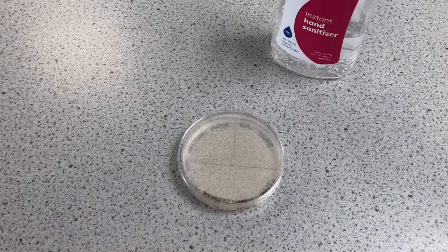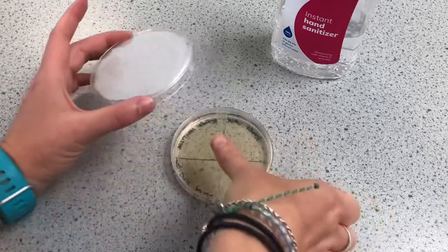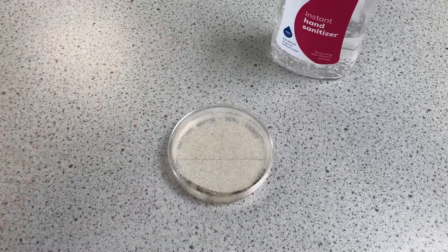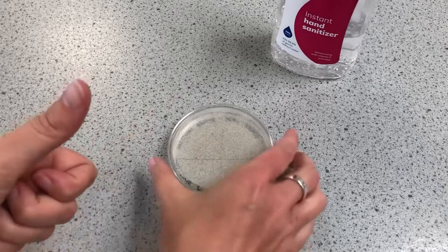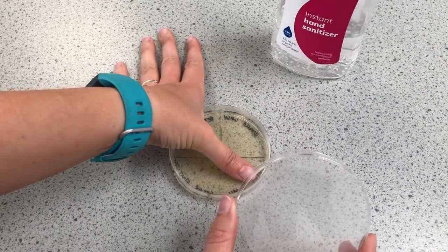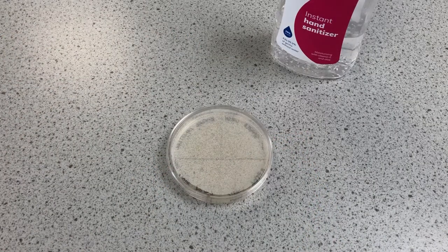Let that dry and then pop that on the 'after sanitizer'. I'm just going to go wash my hand and then I'll come back to you. I've now washed this hand, so I've got 'after washing'. I did use a paper towel and I'm going to pop that on there.